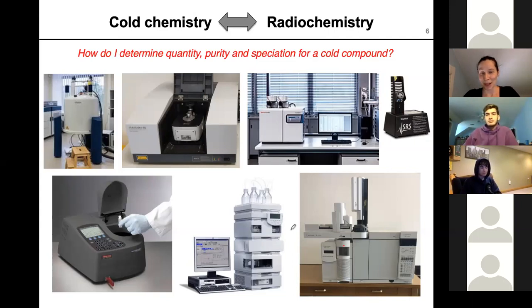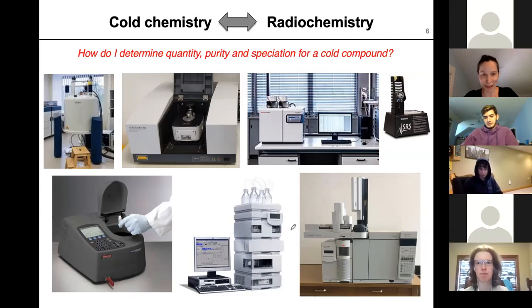I also had IR. I tried to think back at techniques that I had used in undergraduate labs. Maybe some of you have run an IR before. It can be very good to diagnose specific stretching frequencies like carbonyl stretches and things like that. GCMS, so mass spectrometry. How much compound do you need for mass spectrometry? I always use microliters. Sure, so like microgram quantities. Are we getting into the range of radiochemical characterization techniques or something that would be appropriate to characterize a radioactive isotope?